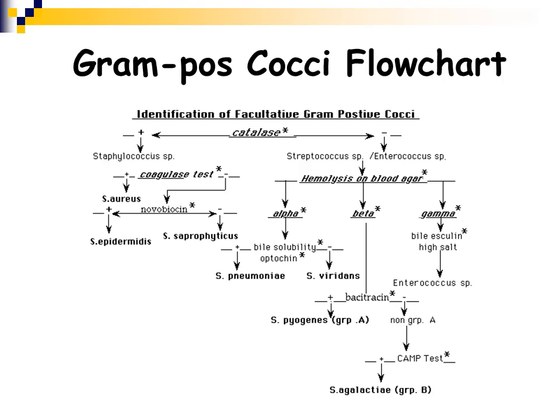If it's catalase positive, it's likely a staph. If it's catalase negative, you're probably looking at a Streptococcus species or an Enterococcus species. The first thing you want to do is look at hemolysis, and then based on the hemolytic reaction, you're going to think of certain organisms and certain tests. So you need to know exactly what these organisms and what these tests are to differentiate between the various Streptococcus species.